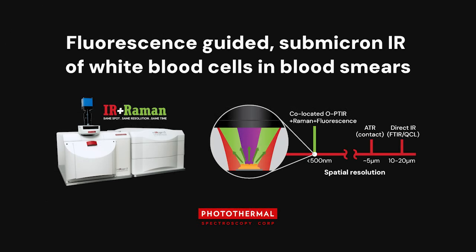Thank you for that, Christoph. My additional comment on that might be that, in my experience, the sample thickness is also perhaps the biggest factor. So I suspect for the thinner cells, you will definitely see larger glass relative to protein peak. So I suspect the biggest factor there is going to be the thickness of your cells.